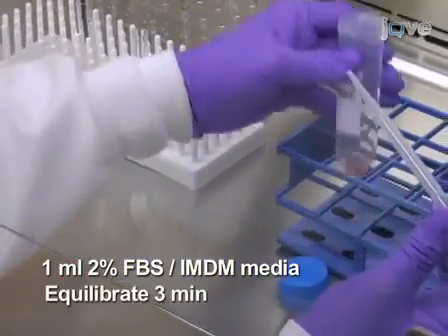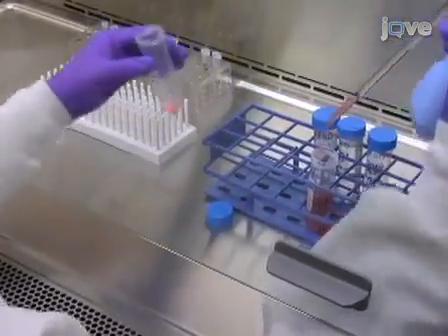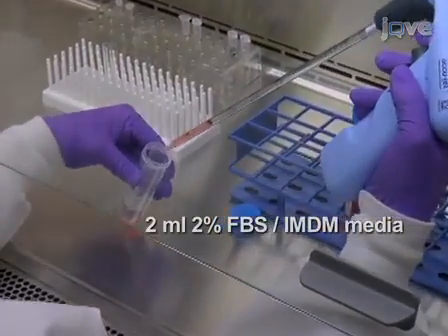Now wait for three minutes. Continue by slowly adding two milliliters of media while mixing gently, and again equilibrate for three minutes.